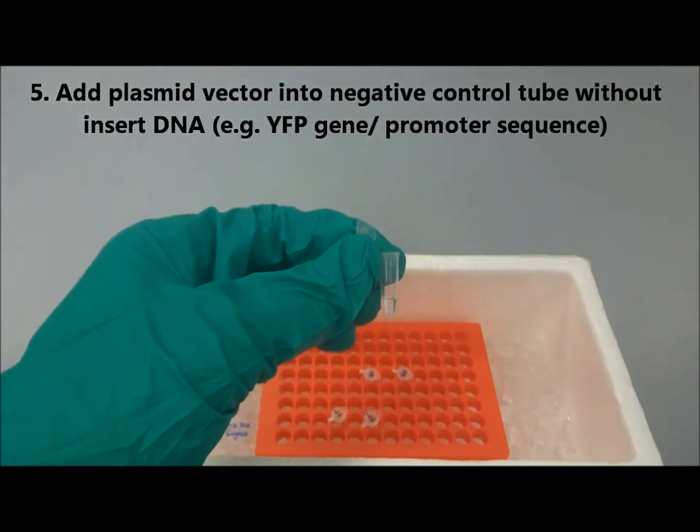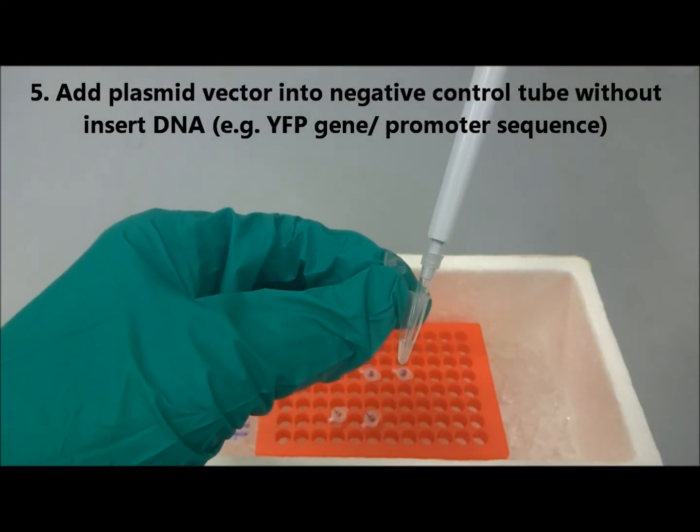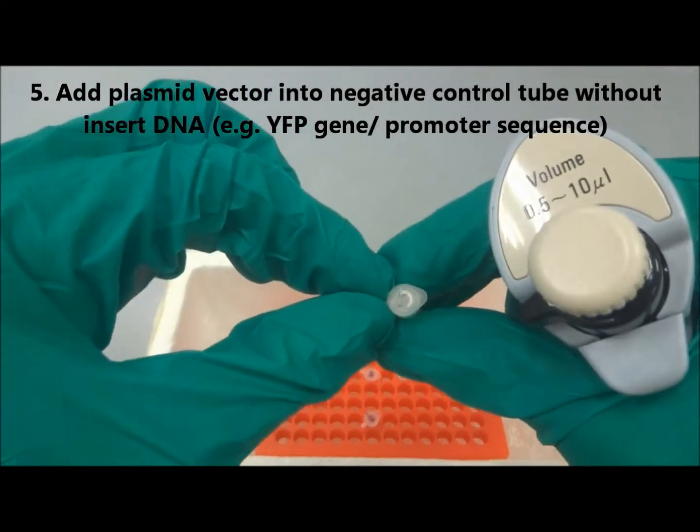Next, add the plasmid vector into the negative control tube without other DNA fragments.